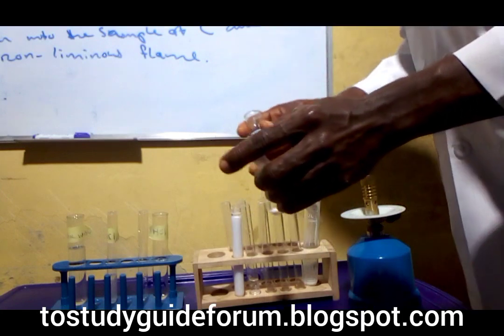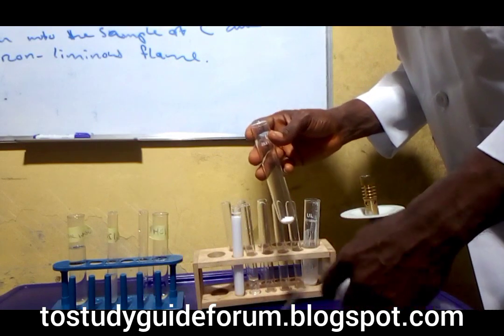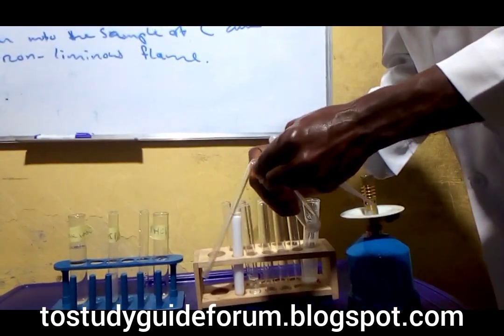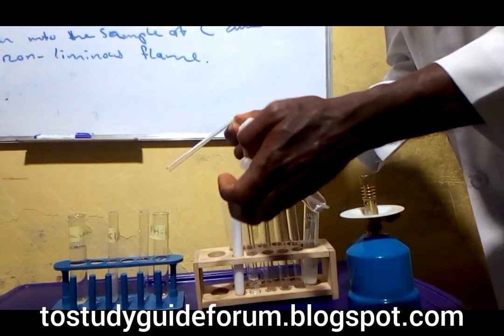So what we do now is to get our delivery tube.